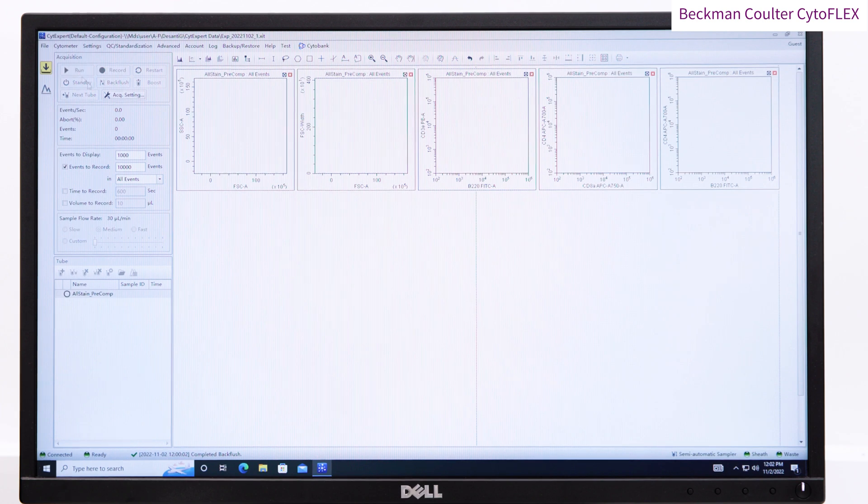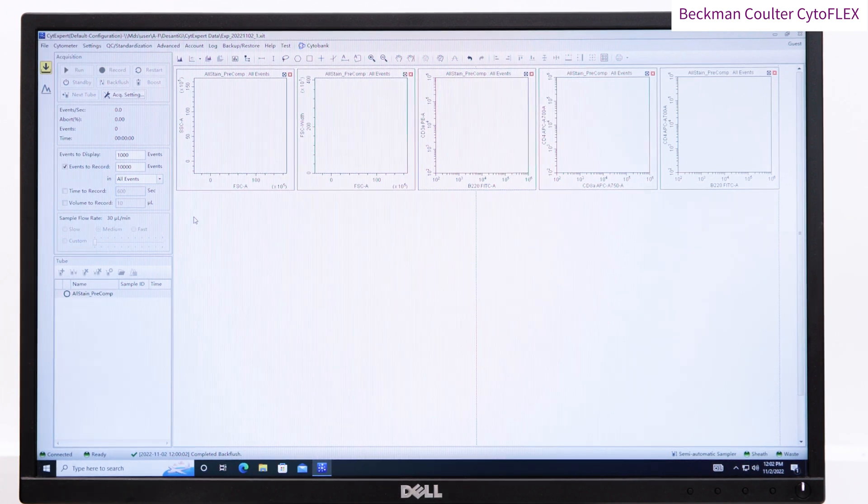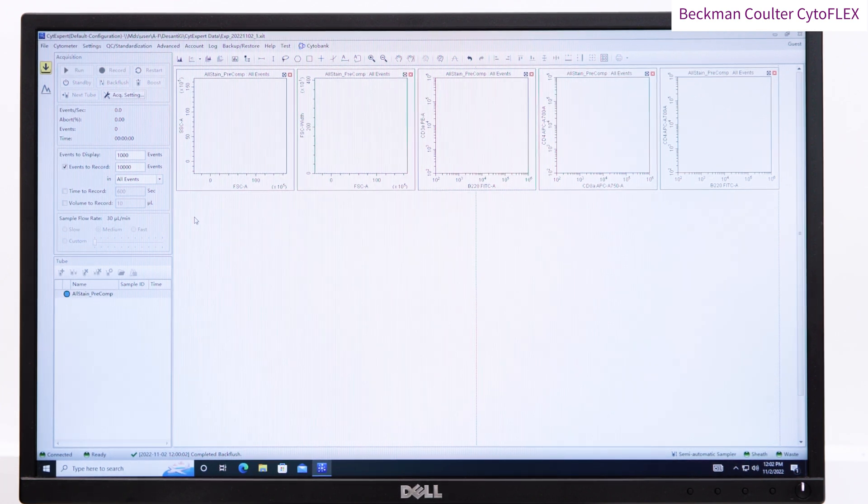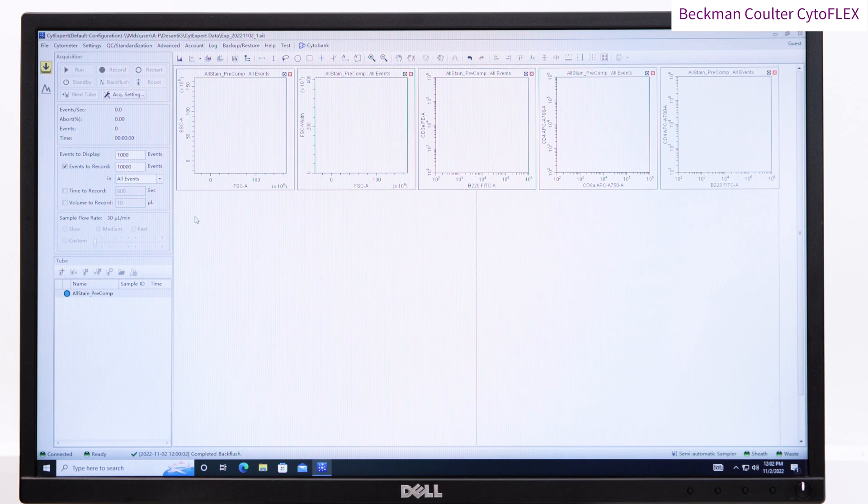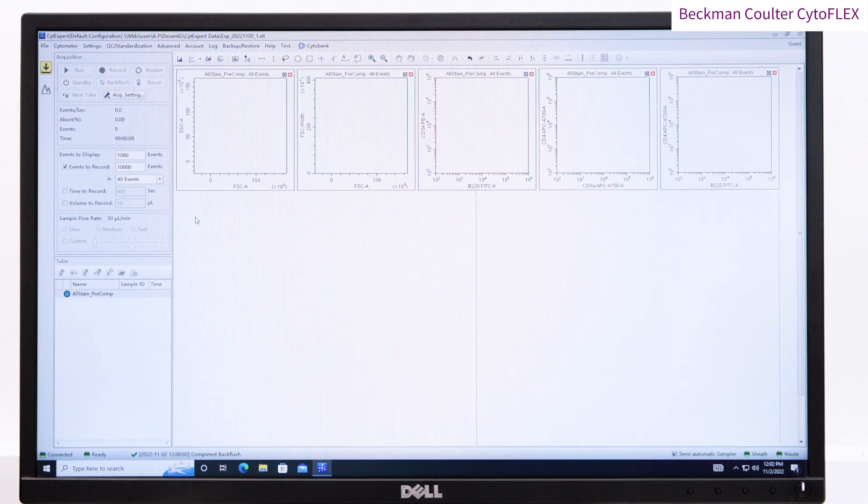I'm going to start by running some of my fully stained sample by pressing Run. Have the sample flow rate set to slow or medium to preserve your sample while making adjustments.